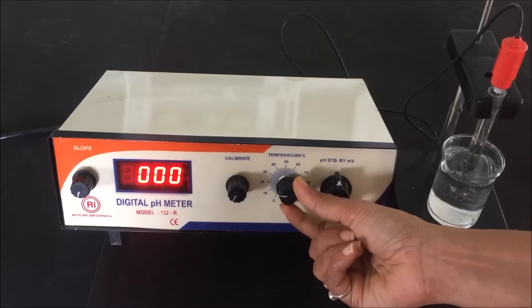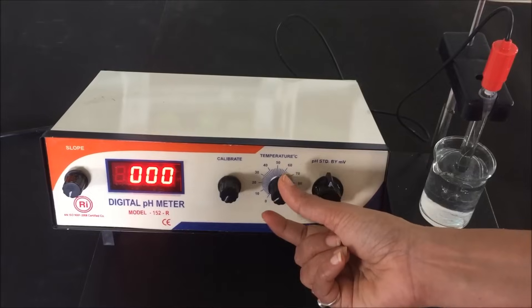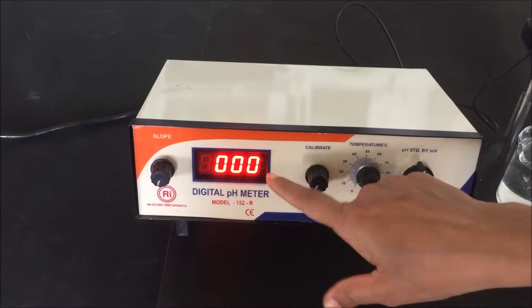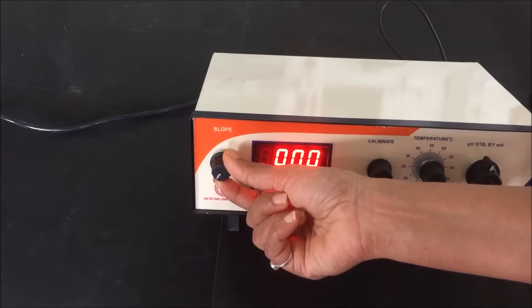This is the temperature setting knob, by which we set the temperature by rotating the knob. This knob is used for the calibration of the pH meter — we rotate and adjust it to set the pH to the standard value. This is the display for reading, and this is the slope knob, which is also used for calibration.